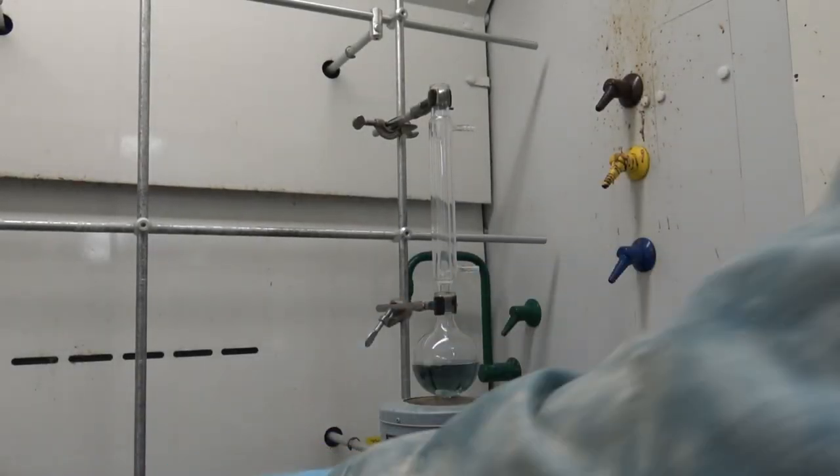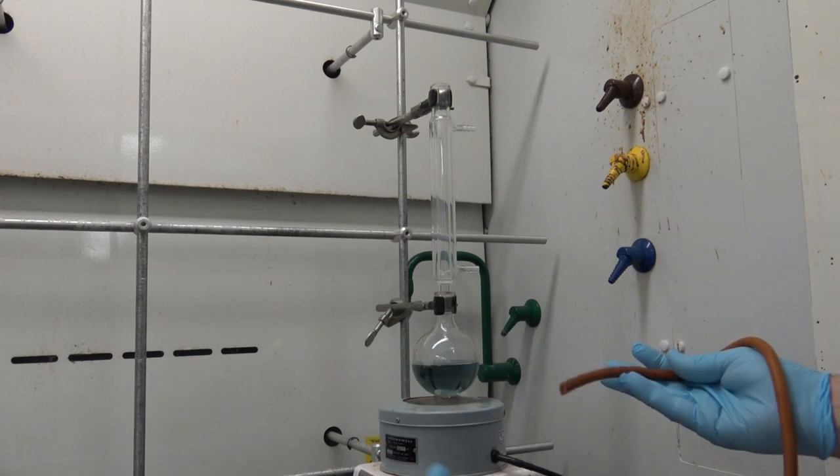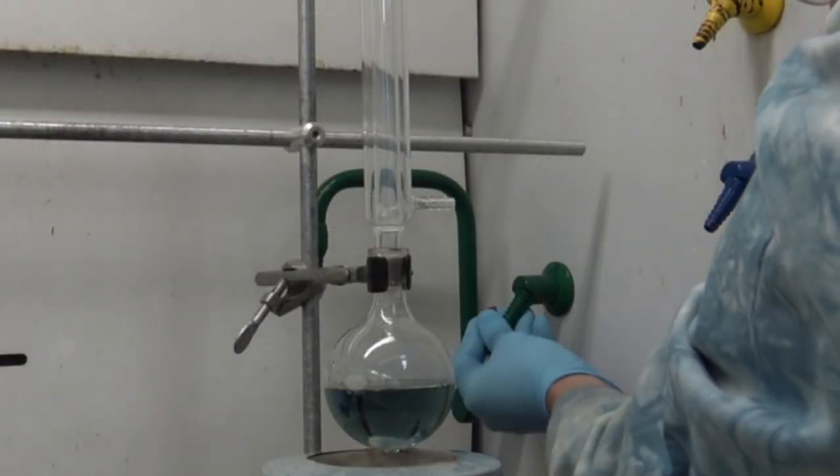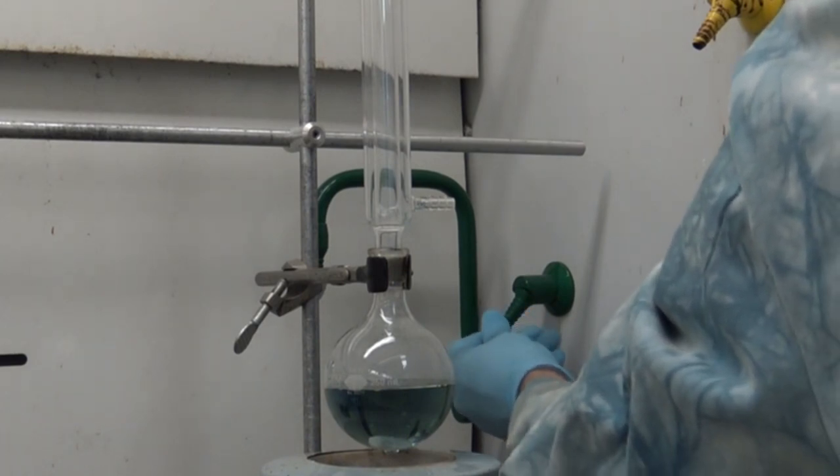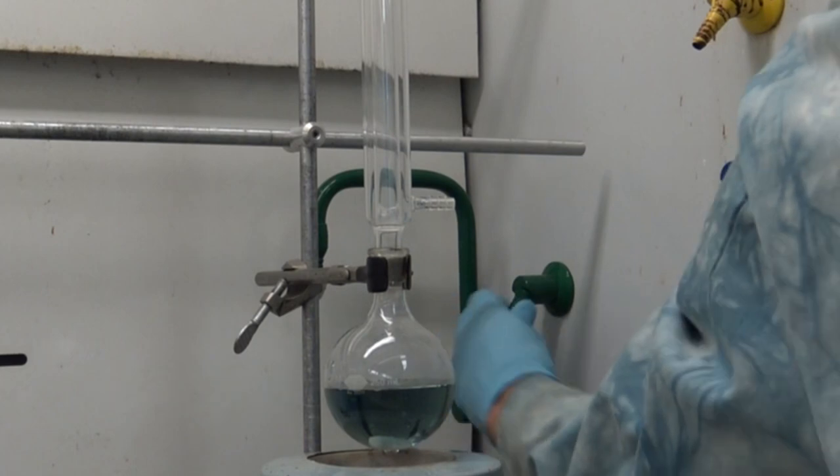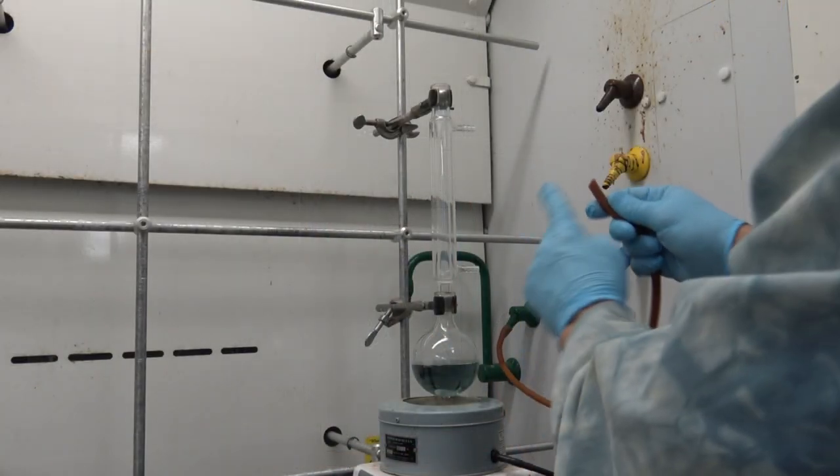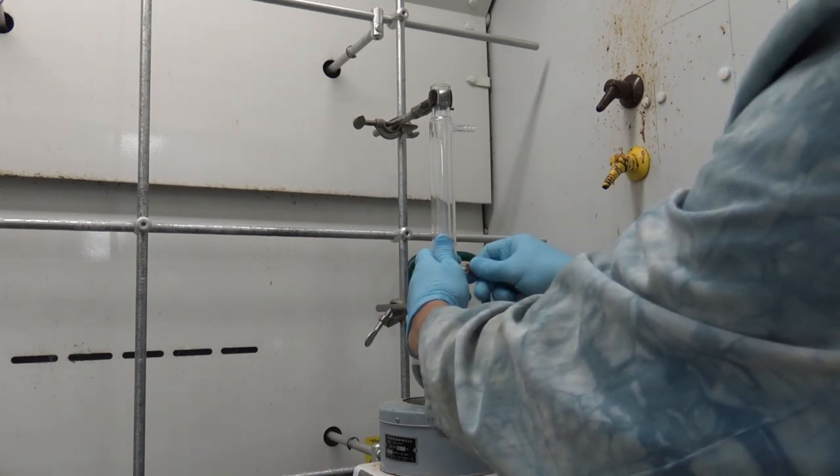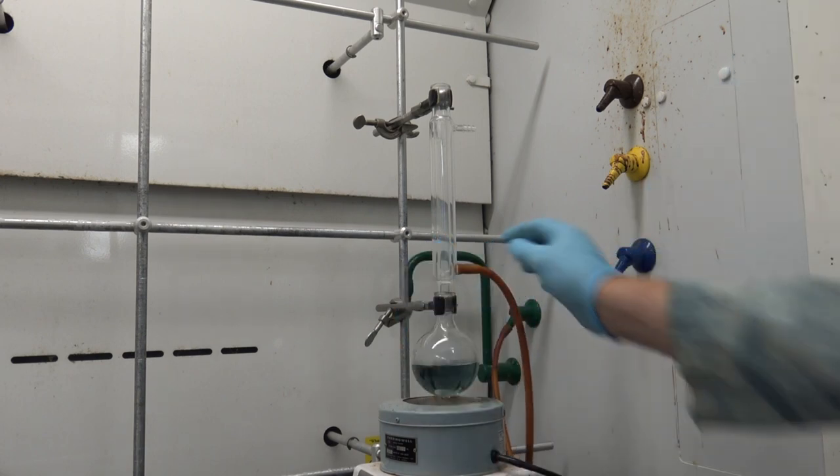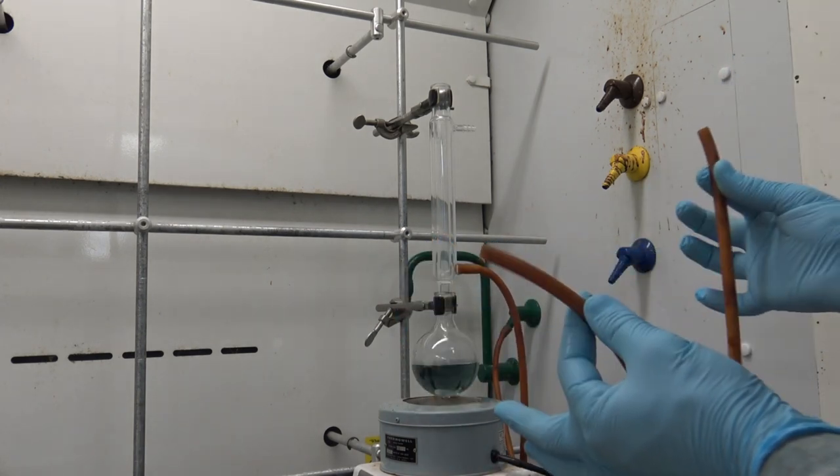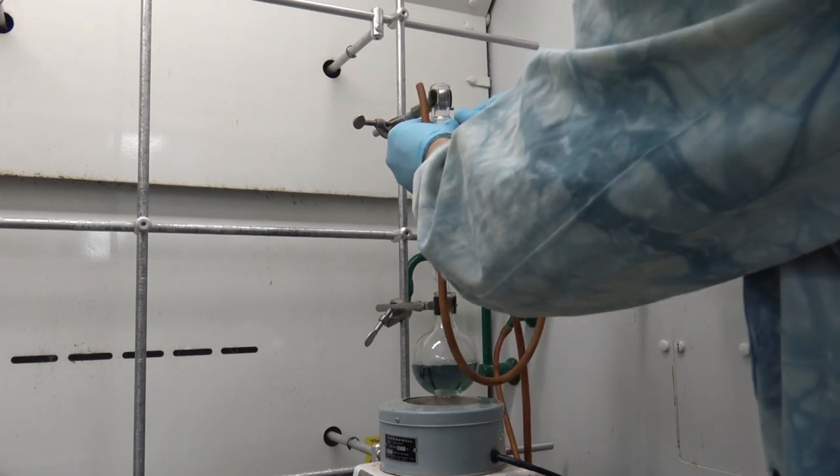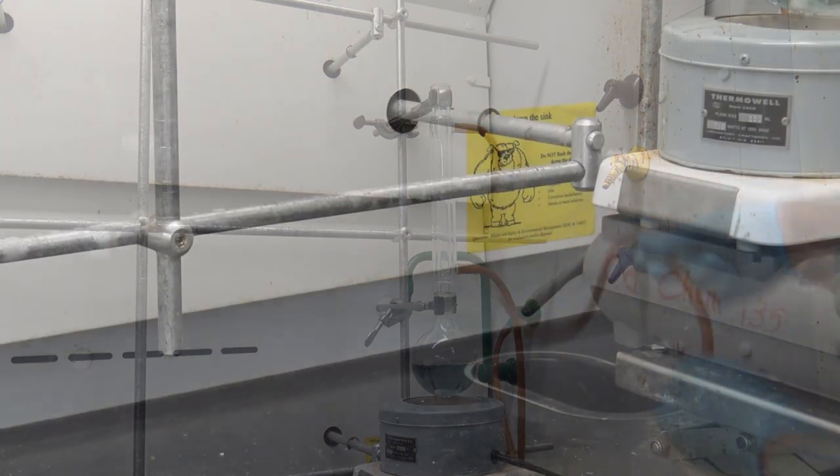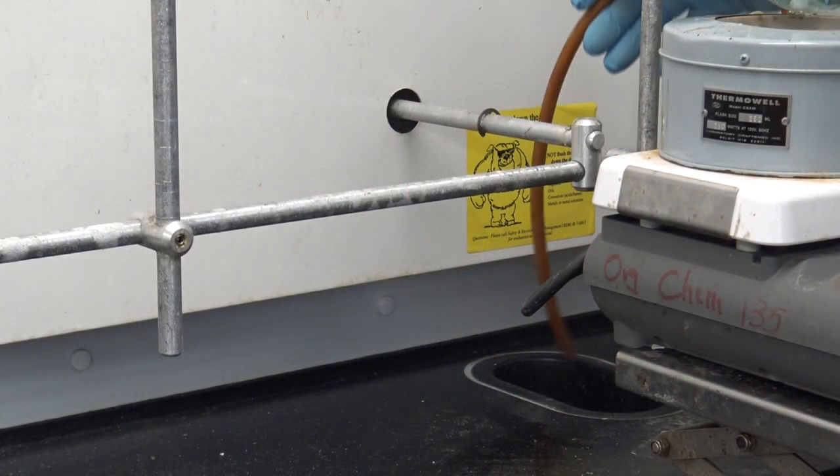Now it's time to ensure that the Liebig condenser remains cold. To do this, I'm going to place a piece of hose over my water source, and I'm going to run that hose from the water source to the hose barb on my condenser at the base. This is very important. The source has to go to the lower of the two hose barbs. This will ensure that the water completely fills the jacket when it's turned on. But before I turn it on, I have to give the water somewhere to go. So I'm going to use my second piece of hose to attach the upper hose barb to a hose running to the cup sink for drainage. So I'll place that hose now in the cup sink in the back of my fume hood.